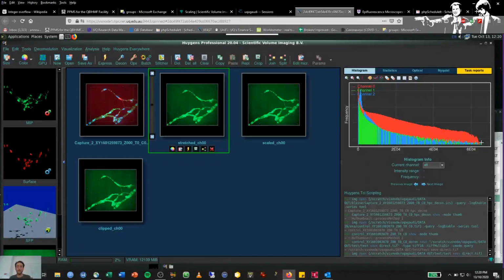You will have a little bit more spread out data, so you will have a little bit more stringency, let's say, in where you put your thresholds, and this will allow you to discriminate structures a little bit more easily.